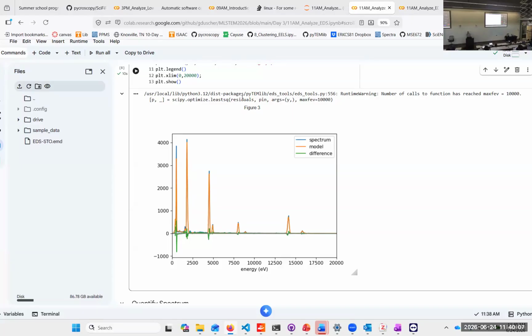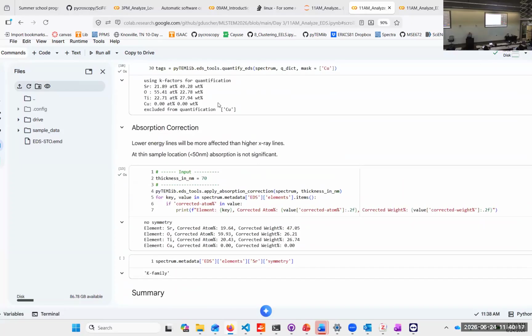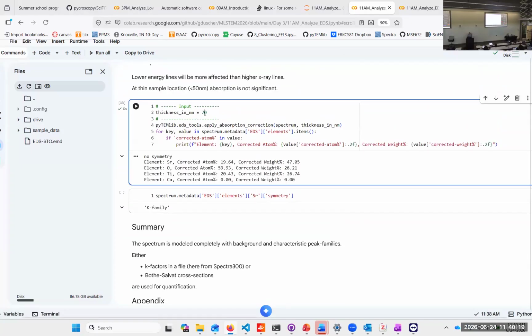So we do that. We do absorption here. In this case, down here, right? So here we do our absorption correction. This is our absorption. That's the A of that. And we do not do fluorescence, because our samples are small enough. So we had this discussion in the last lecture.